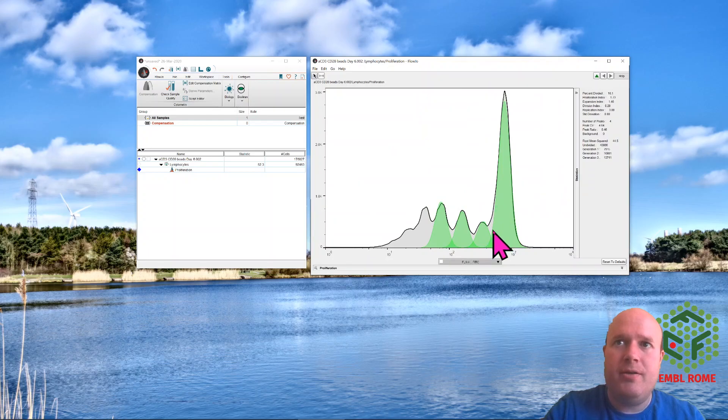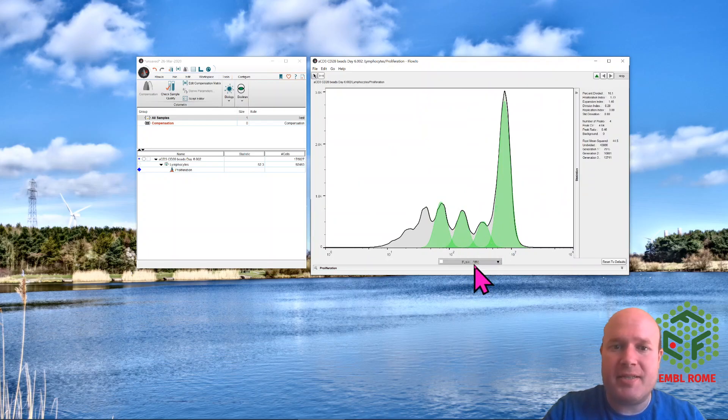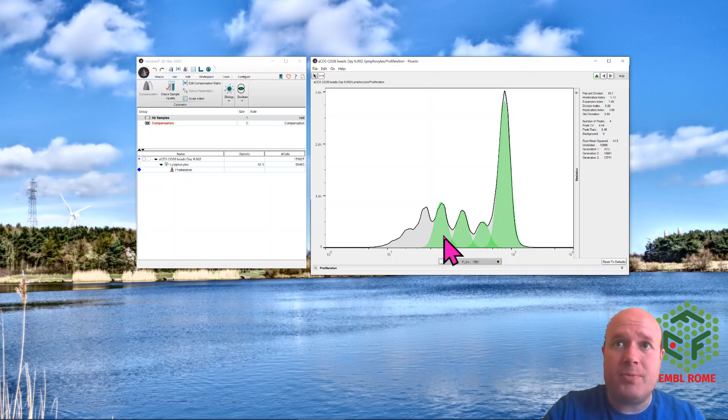So it's worked out where the first, second, third and fourth peak is, using my FITC parameter. This is actually CFSE, not FITC, but it's worked it out automatically.